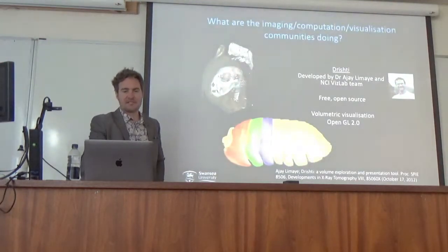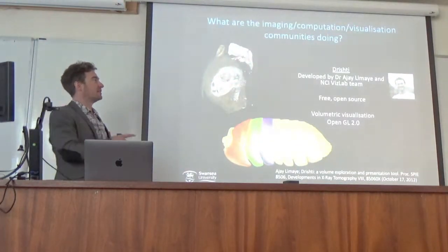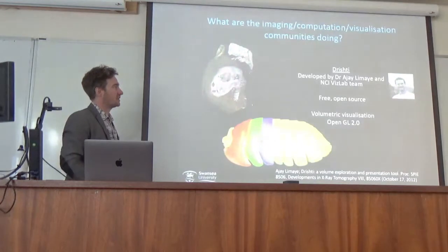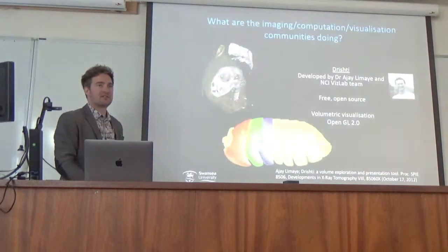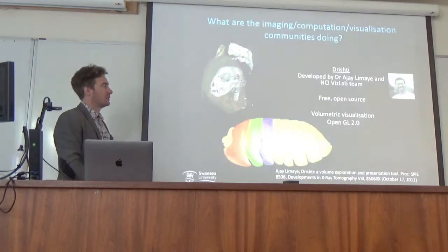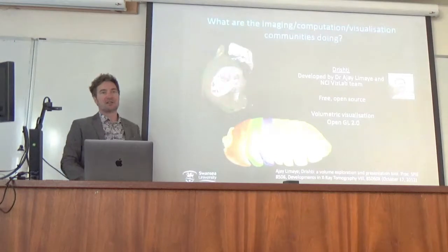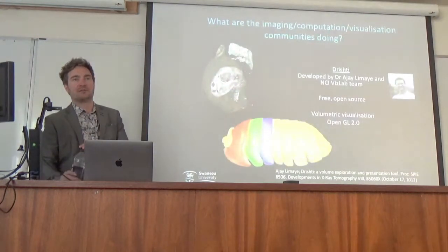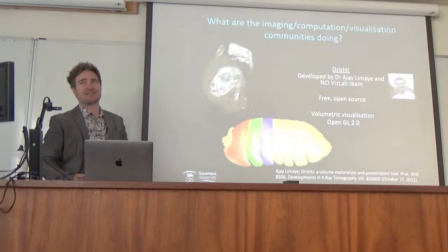So I was talking about segmentation, but a lot of the visualizations I've shown were created in Drishti. This is software created by Ajay Limaye in Australia. It's free, it's open source, and it does volumetric visualization. It's very, very good. Within the tomography community, we love it for its visuals, so its shaders and lighting are amazing. Has anyone come across Drishti?